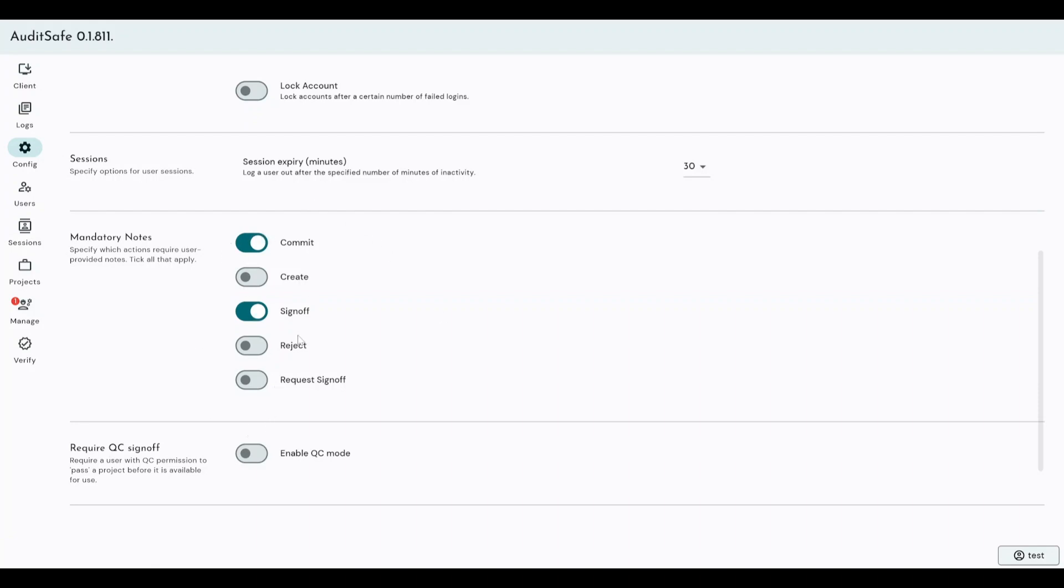We've got the ability to add mandatory notes at different sections of your analysis, and you'll see that as I go through the client guide.